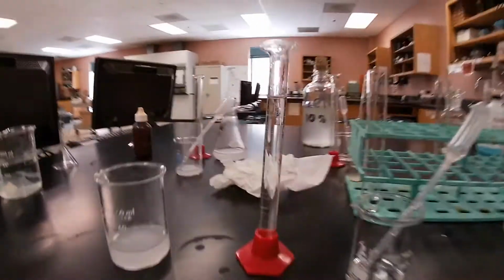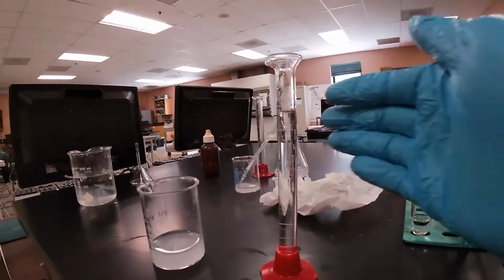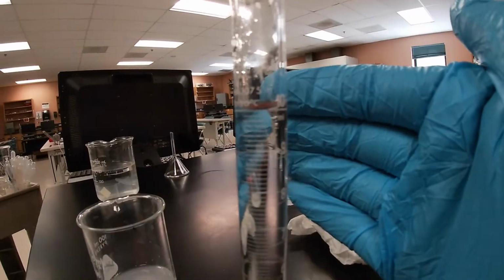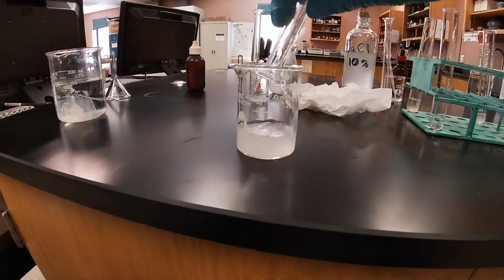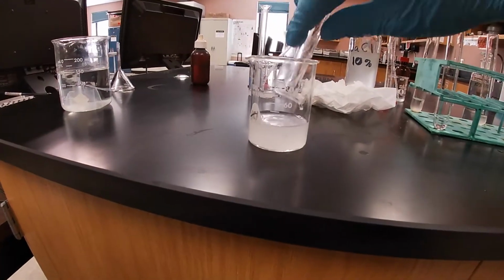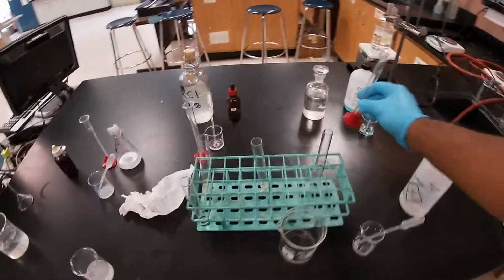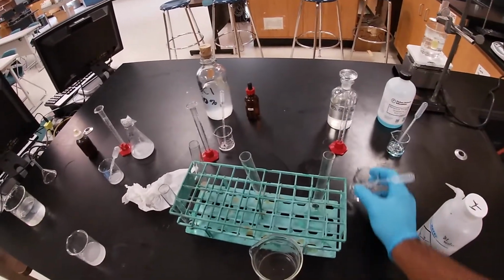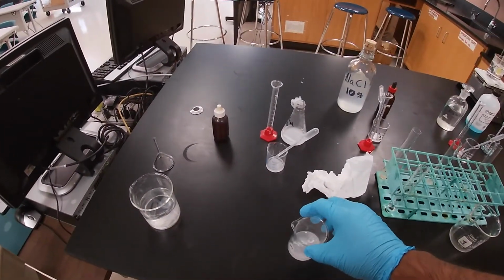All right, and we got our 10 milliliters there of our glucose solution. You can see 10 milliliters. We're going to pour it into our mixture beaker. I'm going to put everything back. And then, so this is our mixture.